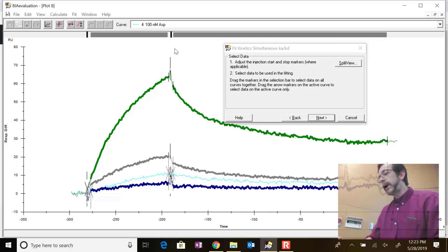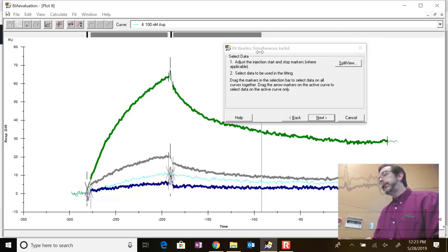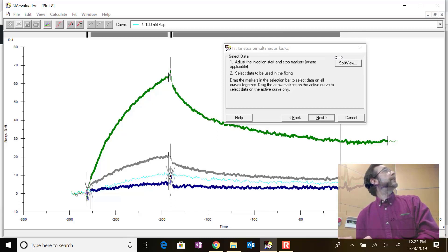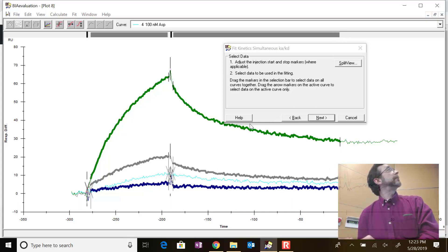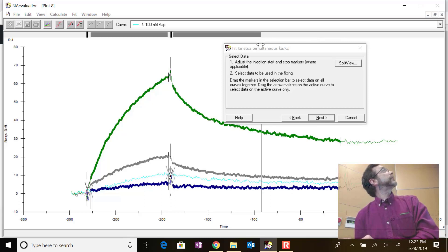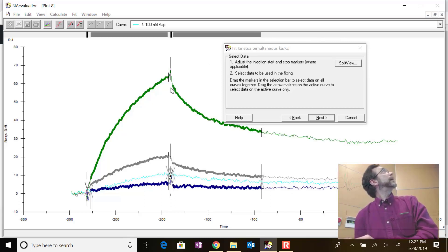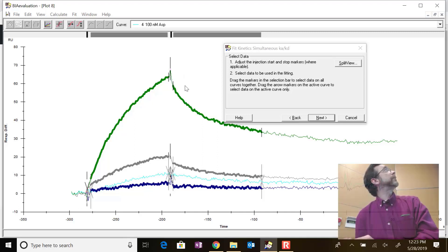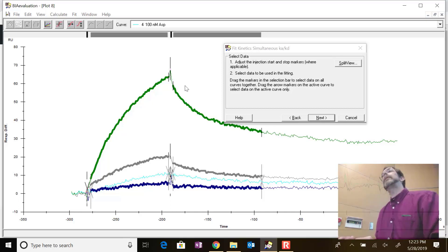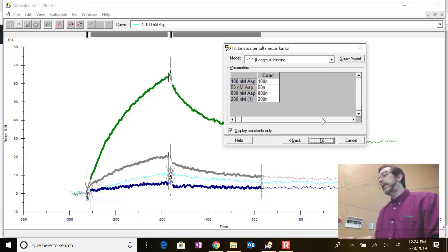You're using your pattern recognition to tell the computer where real data is. For the dissociation phase, you don't want to include too much - definitely don't include all the way to the washed data. Including too much also means you have more dissociation data than association data, which I think unfairly weights the dissociation. I usually try to make the dissociation bar match the association bar in length. The spike is still affecting how things drop off, so a little drop from association to dissociation is probably instrument artifact rather than real data.